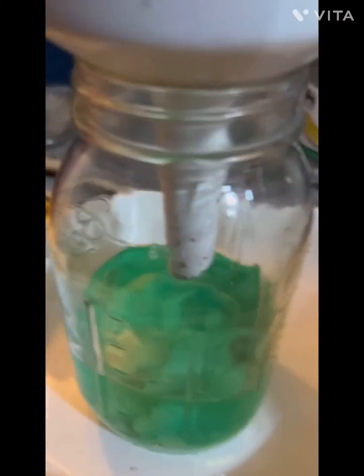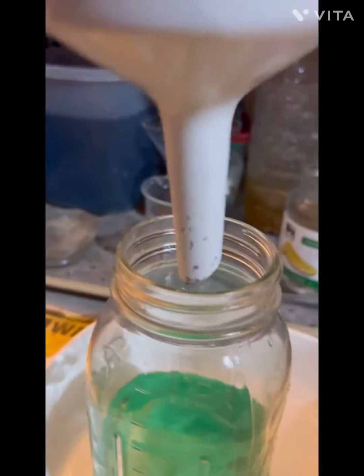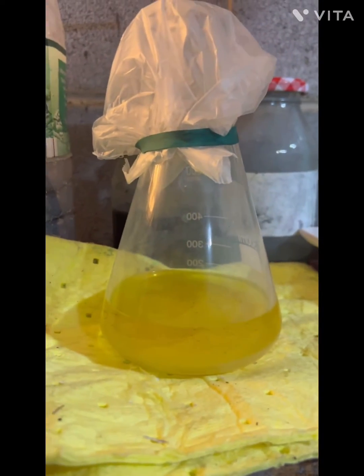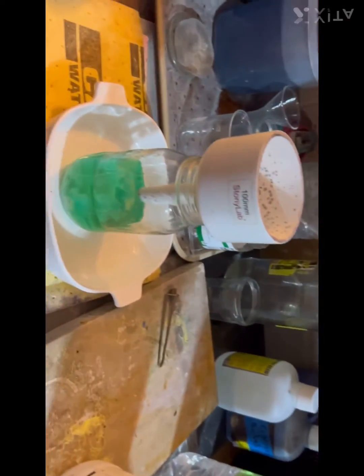I'll give you a bird's eye view of the top. I'm going to drop some gold in. We've got a little bit of chlorides in there we're going to have to filter out — you can definitely see it on that one. But here we go, guys.